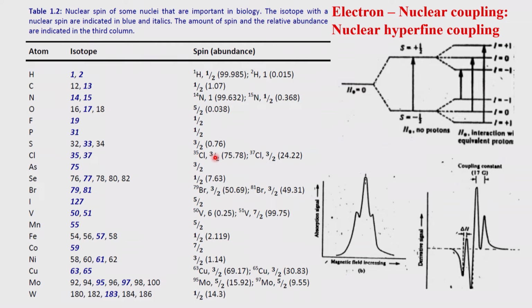Similarly here, the hyperfine signature pattern. This hyperfine signature pattern is very unique for that particular thing, so nothing else will match. Now I hope you got the whole exercise. I took it one by one, but you need to spend a little time.